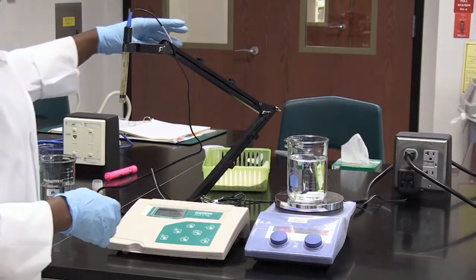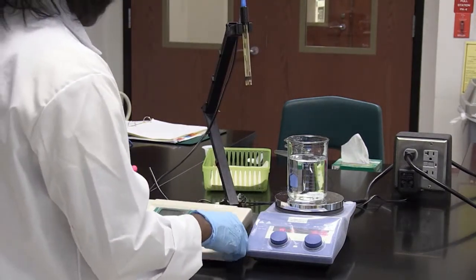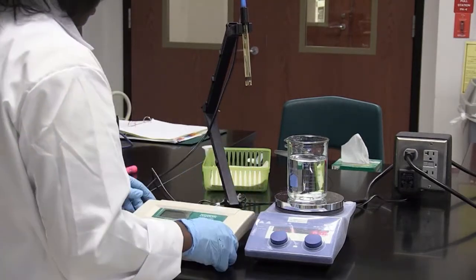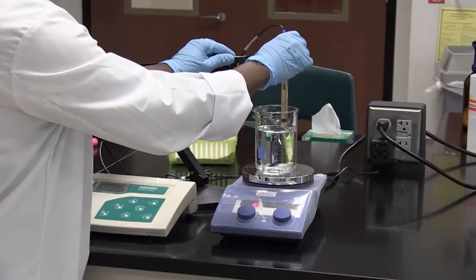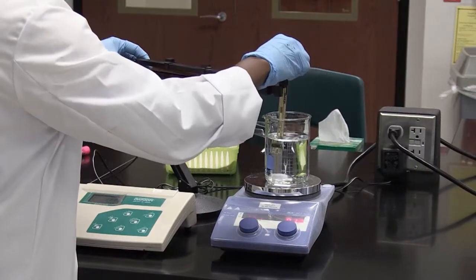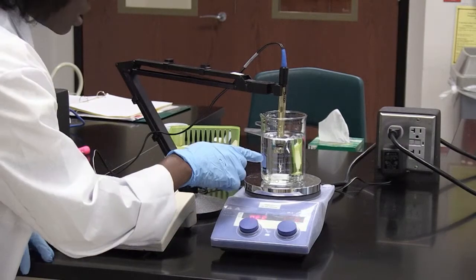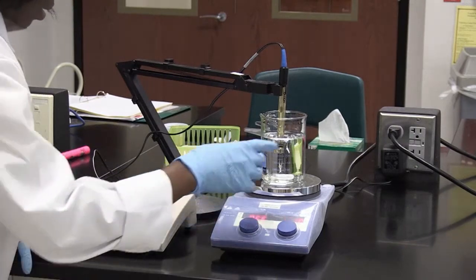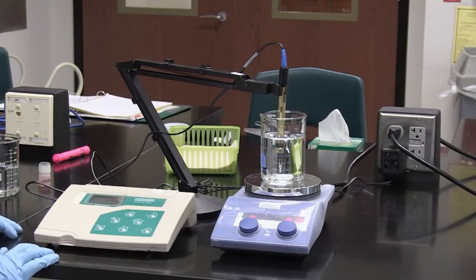Then I'm going to put the electrode into my solution. I make sure I insert it, but not down to the bottom, because you do not want it to contact the stir bar — that could damage the electrode. Now the pH meter has taken a reading; it's at 7.24.